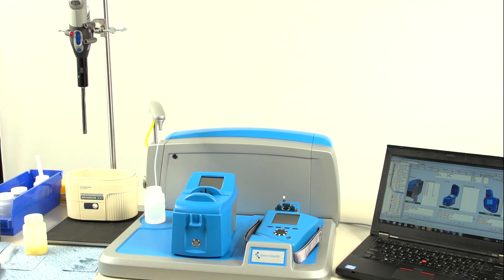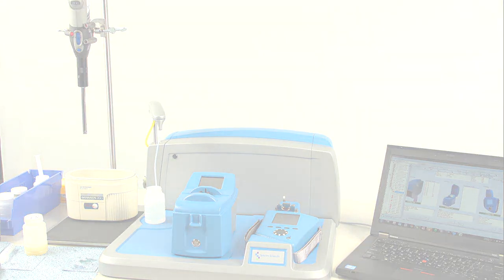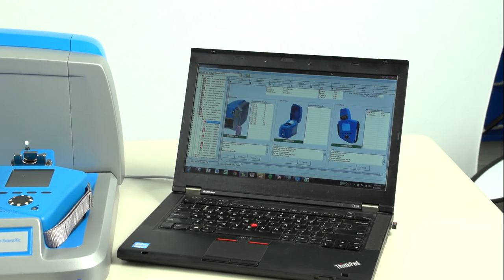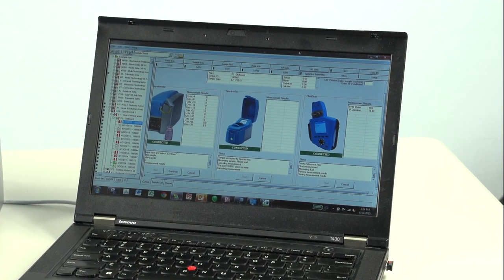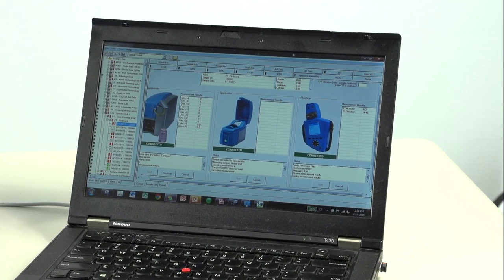So, we've completed two of the three tests. We've completed the viscosity measurement and the FluidScan oil chemistry and water content measurement. The data from the three instruments are now recorded into the AMS, Machinery Health Manager, OilView LIMS database.